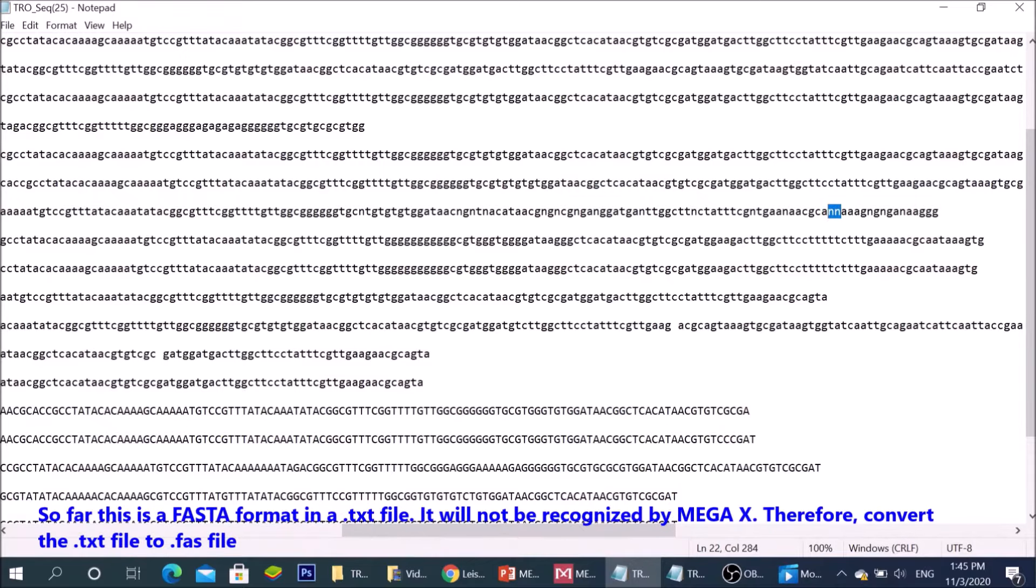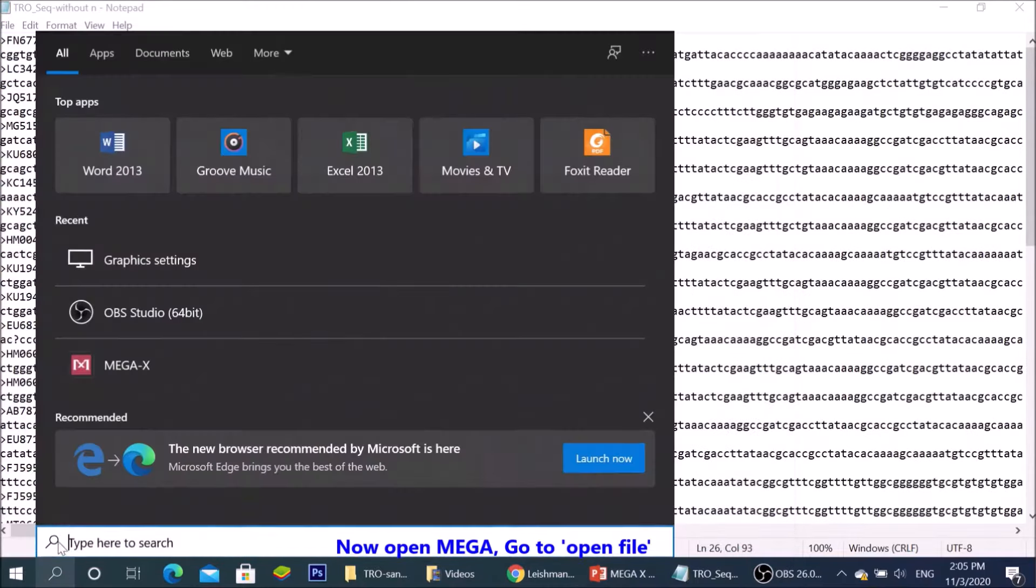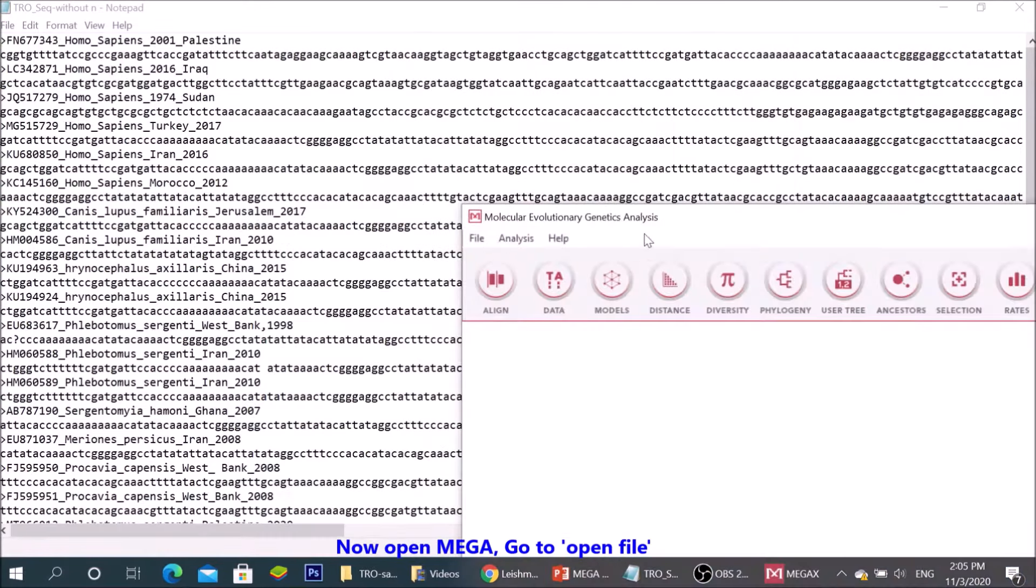So far, this is a FASTA format in a TXT file. It will not be recognized by MEGAX. Therefore, convert the TXT file to FASTA file. Now, open MEGA, go to open file.